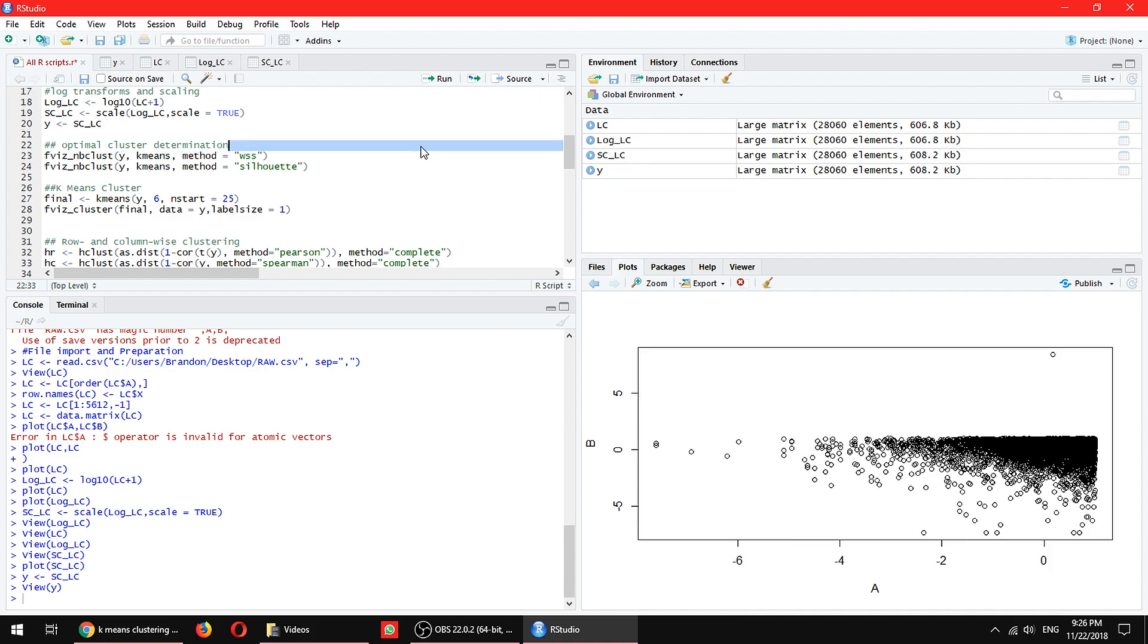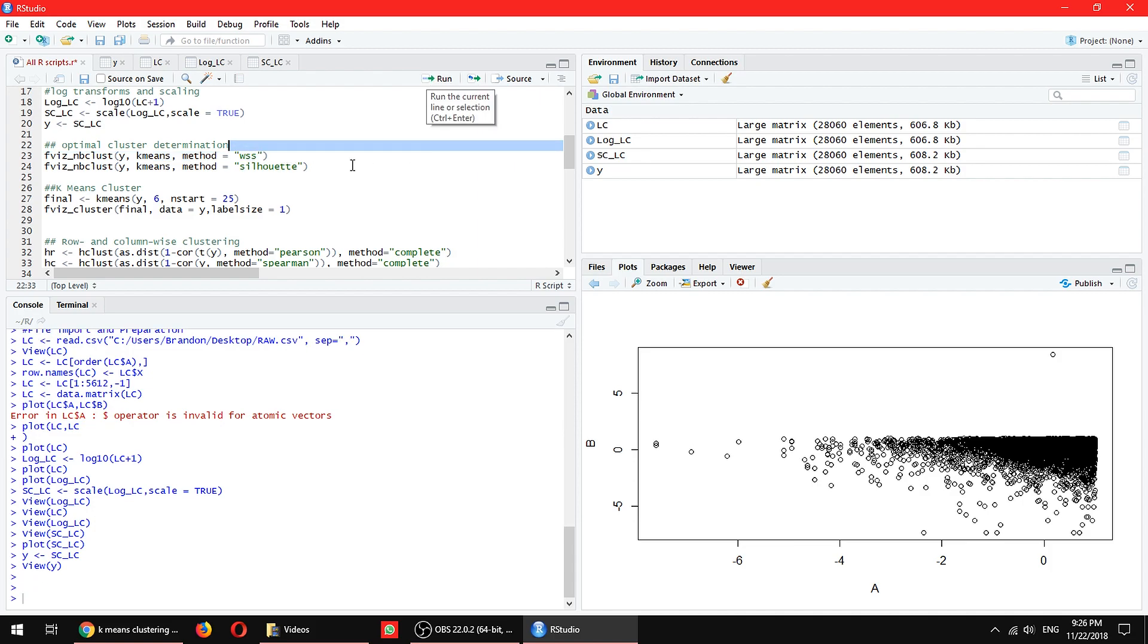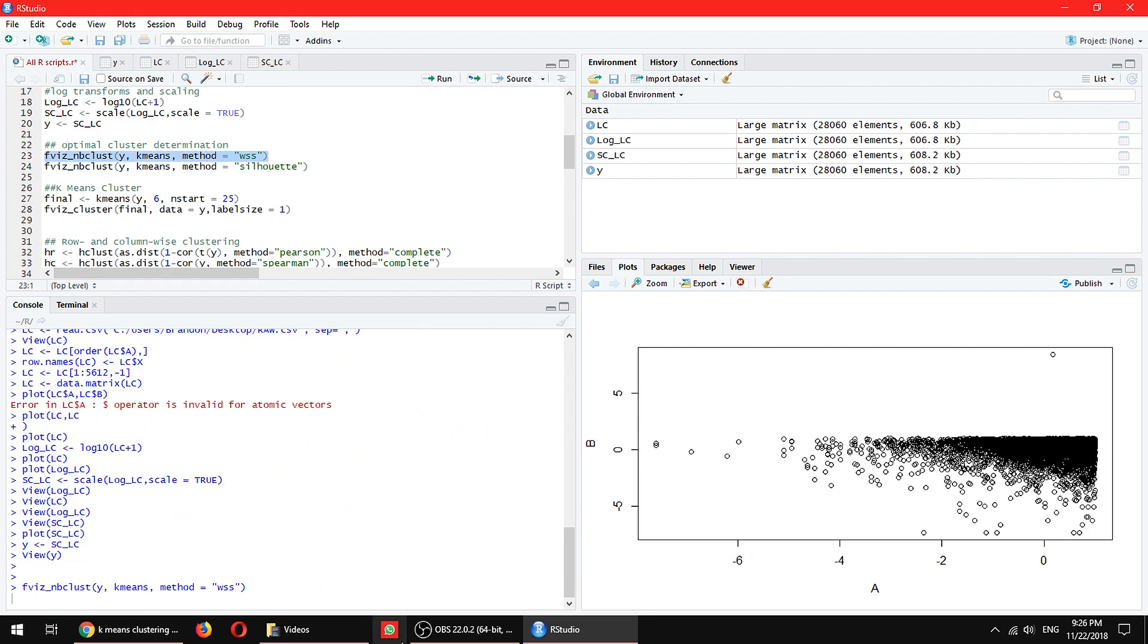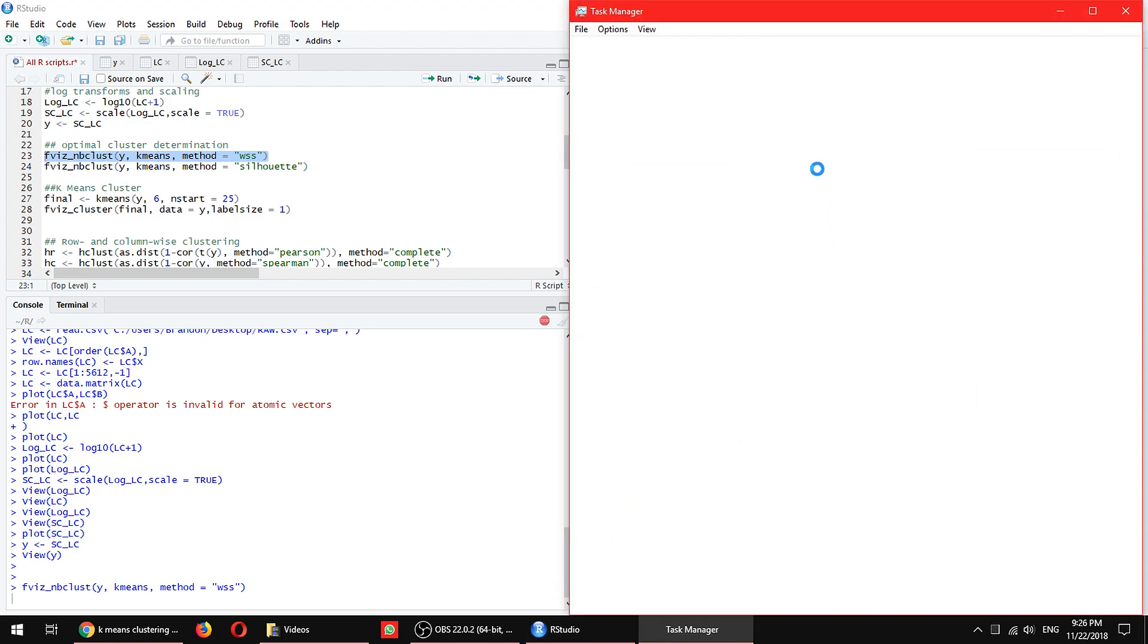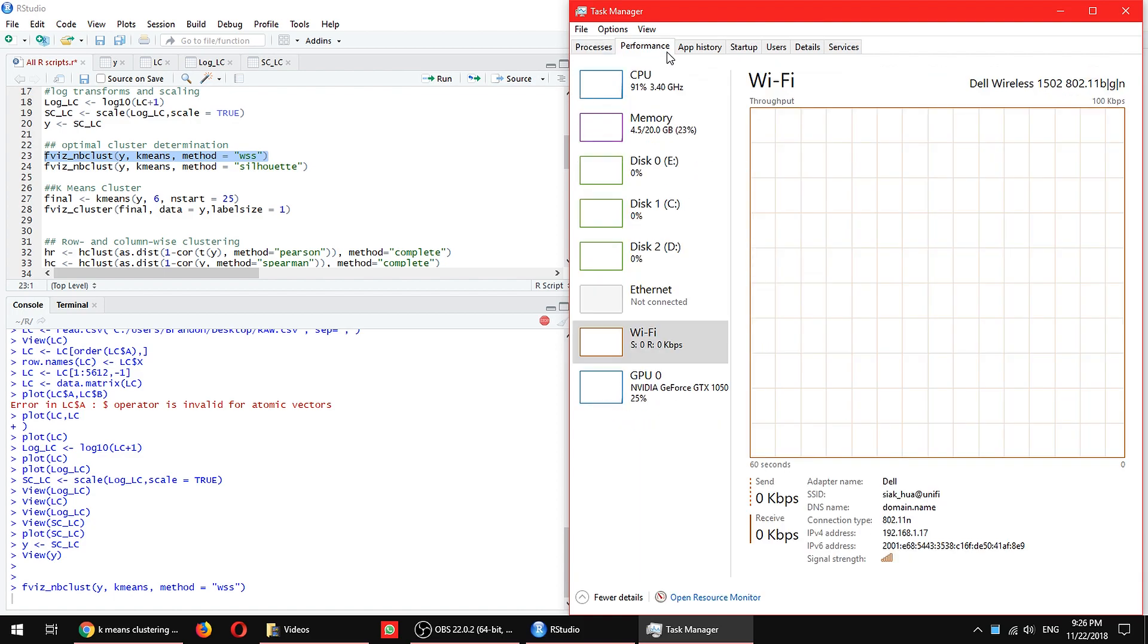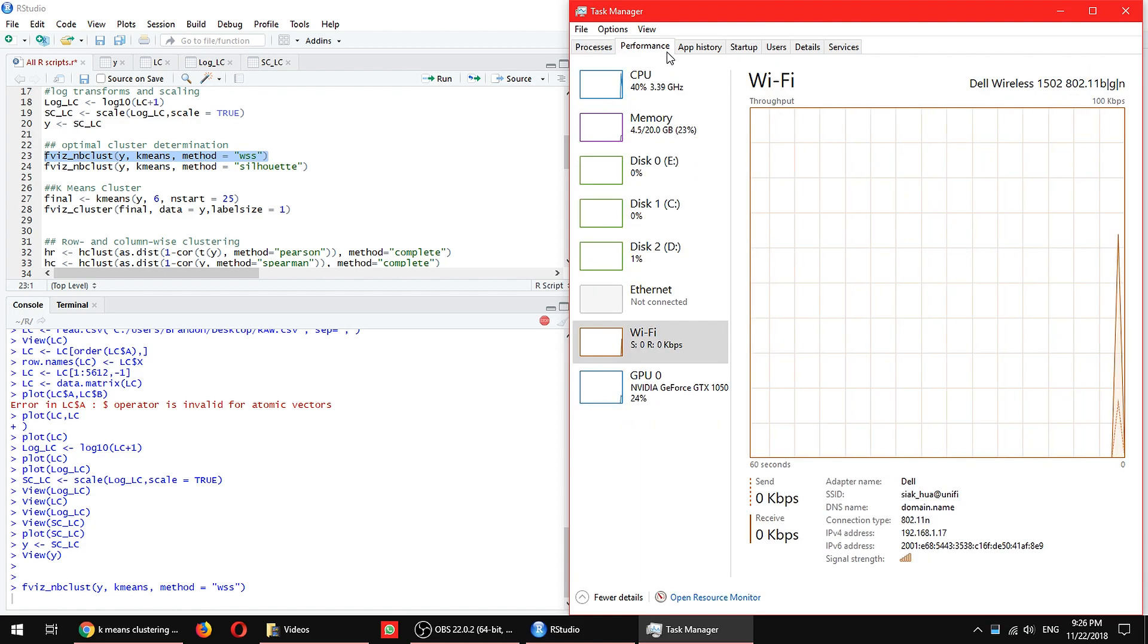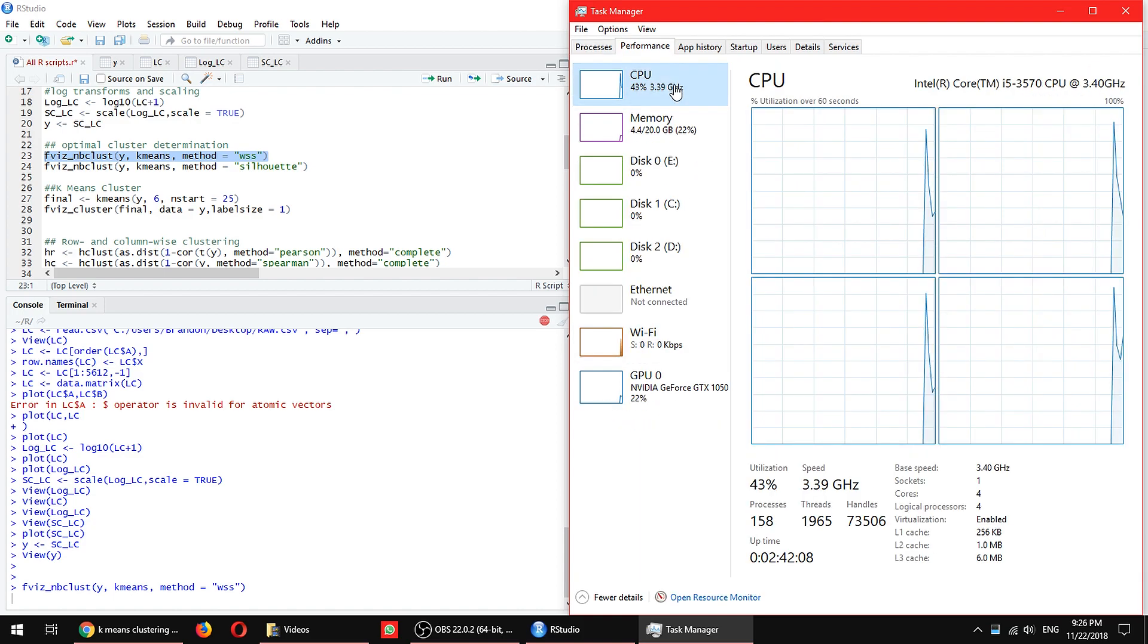In this case, I'm just going to run the first one. Very easy. Highlight the thing, press run. This is going to take a while if I'm not wrong. Sorry, I have not highlighted the text. Let's just run this. This is going to take a while because I actually would need a lot of calculation behind this. Let's check our task manager.